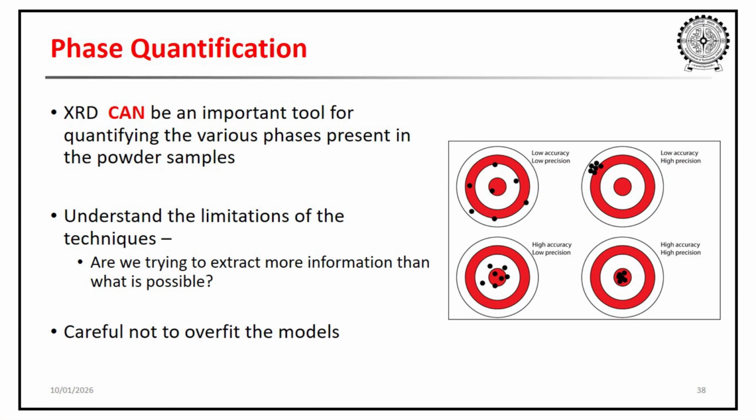Now phase quantification, now this is a place where XRD is getting a lot of value addition.